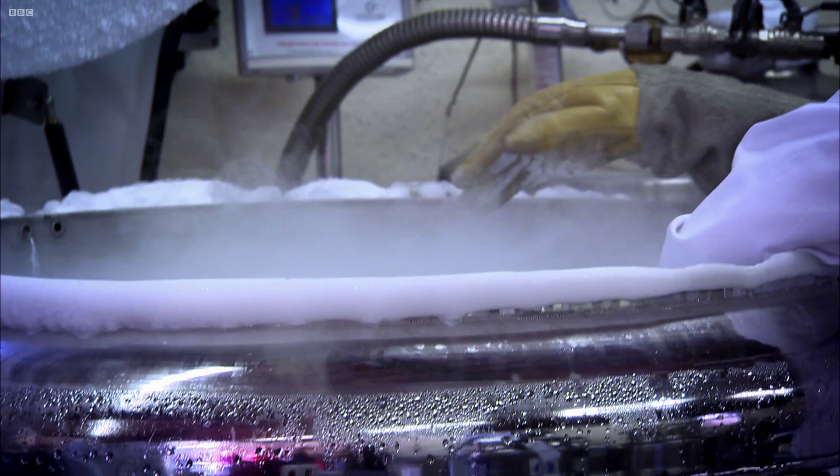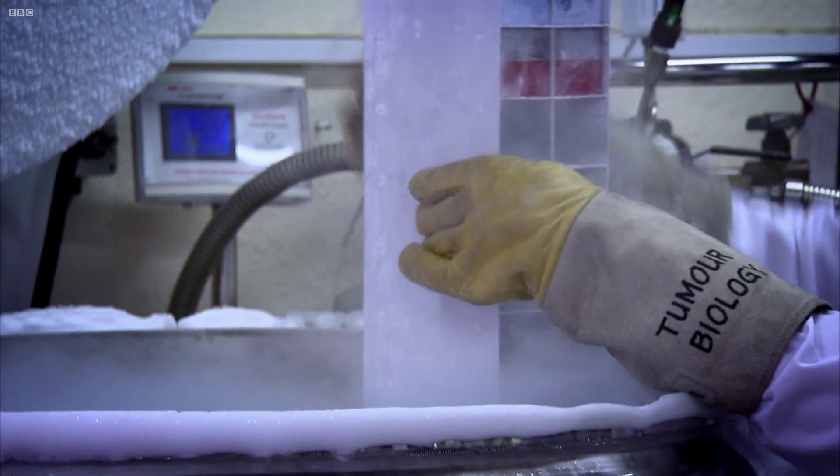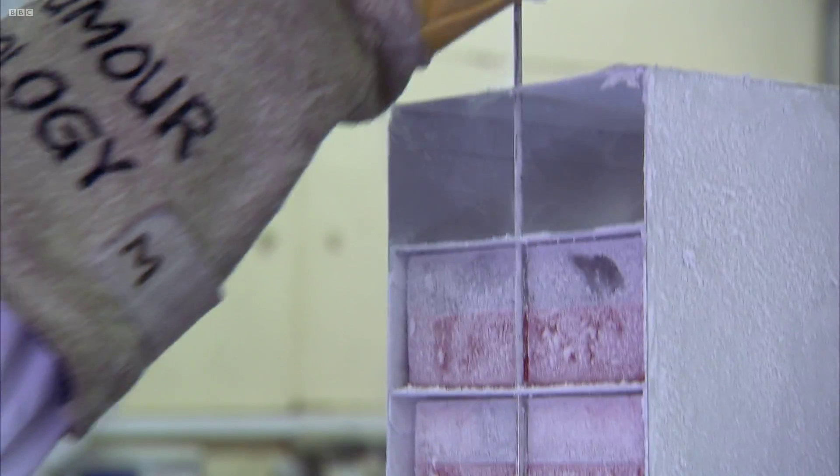Although it looks quite low-tech, the samples are kept at minus 184 degrees and will only be defrosted when needed for vital research. Louise explains that the tissue bank is going to make a real difference, because anything that makes a difference in cancer treatment ultimately has to be proven in tissue samples first.